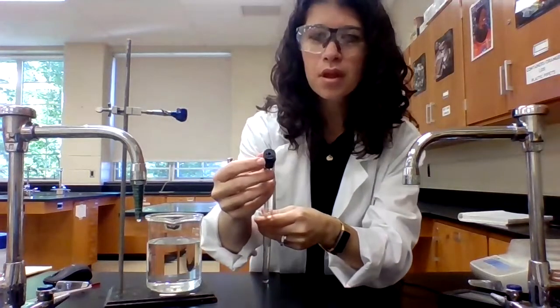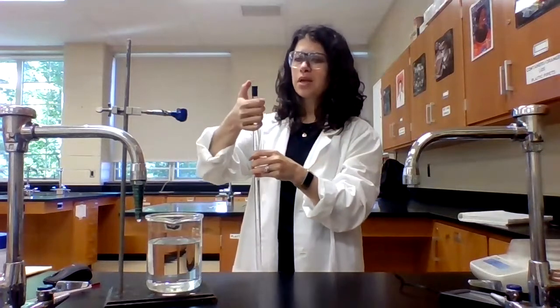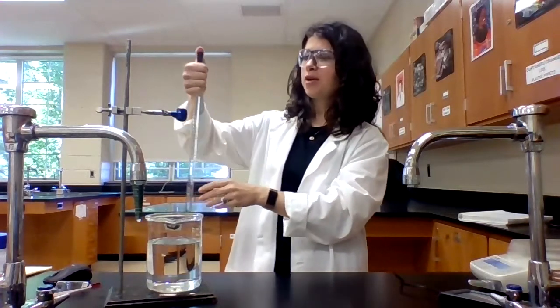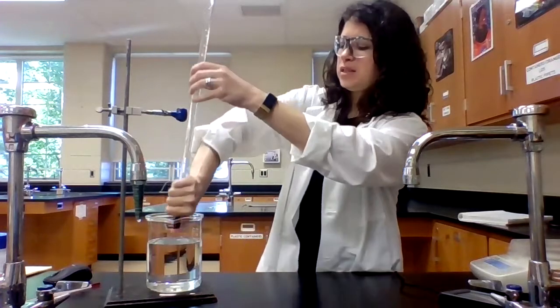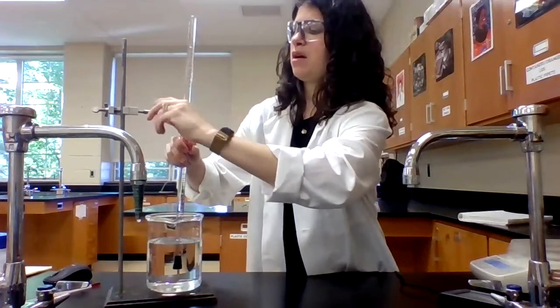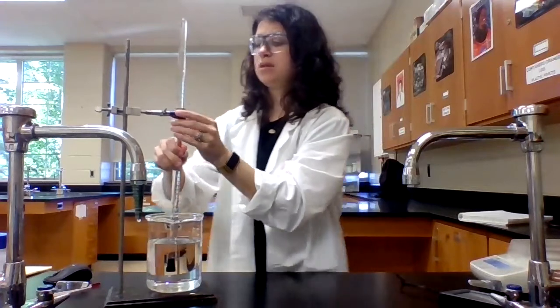So there's a hole in the stopper. And that hole is important because the water needs somewhere to go. Otherwise, the pressure from the hydrogen gas would cause this to explode. So I'm going to cover that hole with my thumb just to make sure that no air or anything gets inside the eudiometer. And I'm going to invert this and put it into the beaker of water. And then I'm going to clamp this so that I don't have to just keep holding it this whole time.